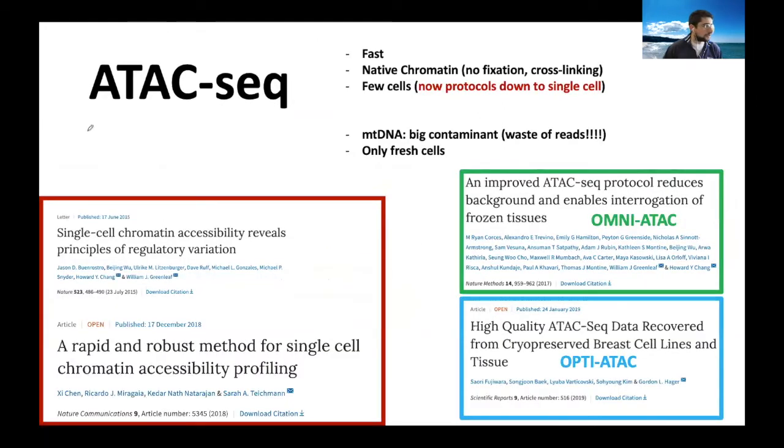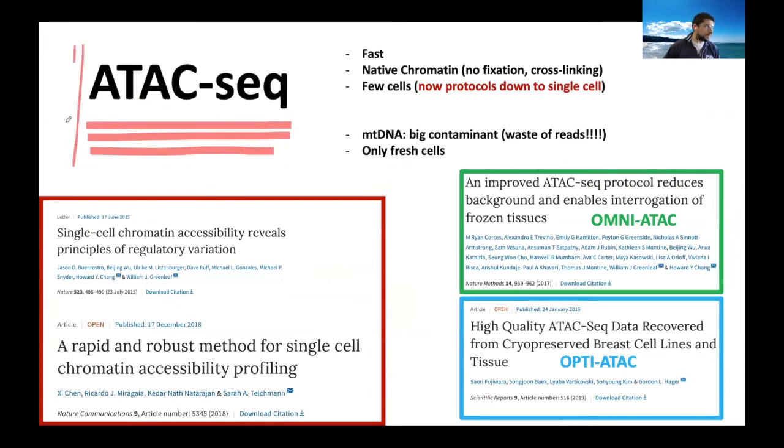All right, there are variations on this. I know that ATAC is a very popular application. The original paper was described quite a long time ago. There have been minor modifications, but with a major improvement of the output of the technique.